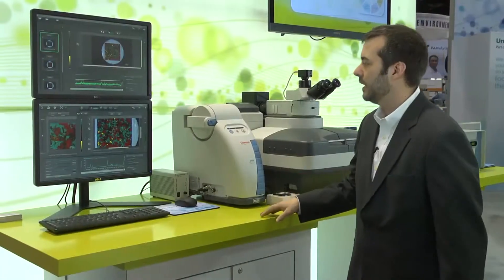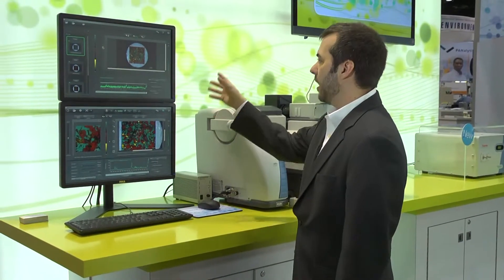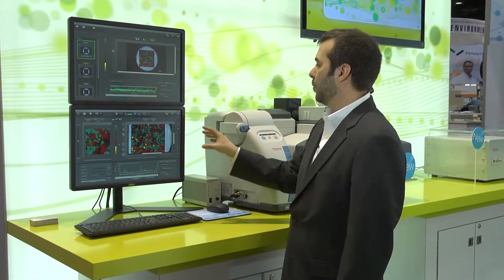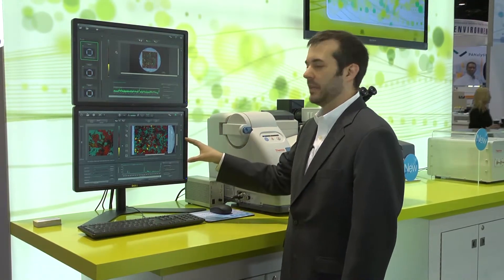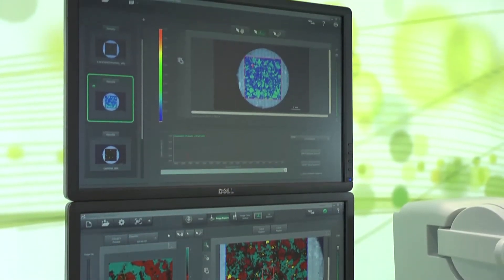So if we take a look at the screen, you can see here we have a pharma tablet and we're doing real-time component analysis as we're scanning. That allows you to identify specifically where your material is, how it's distributed, and how much is there.